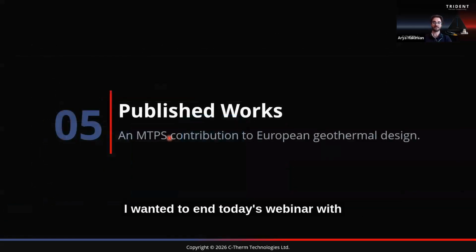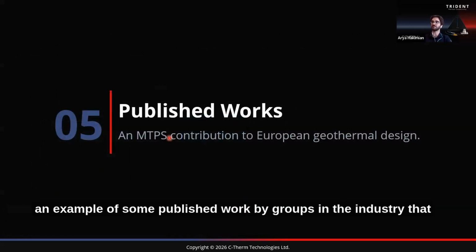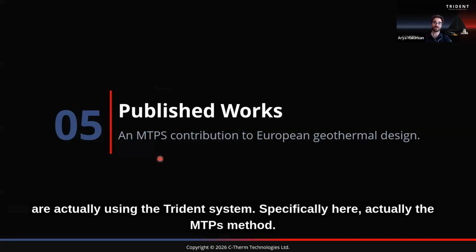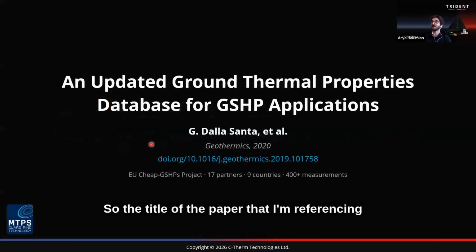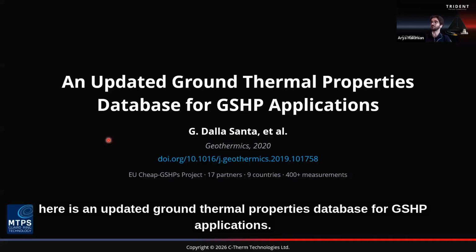I wanted to end today's webinar with an example of some published work by groups in the industry that are actually using the Trident system, specifically the MTPS method. We're looking at an example that was done over in Europe on geothermal design. The title of the paper I'm referencing is an updated ground thermal properties database for GSHP applications.